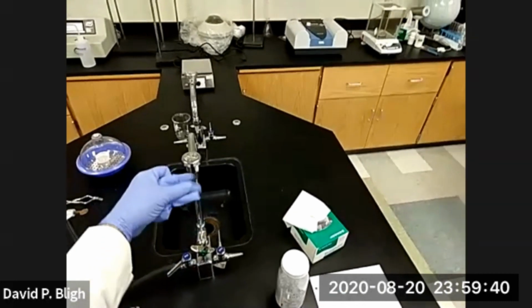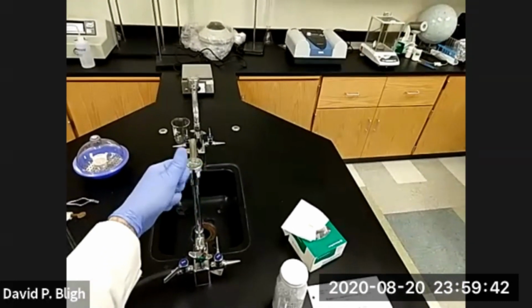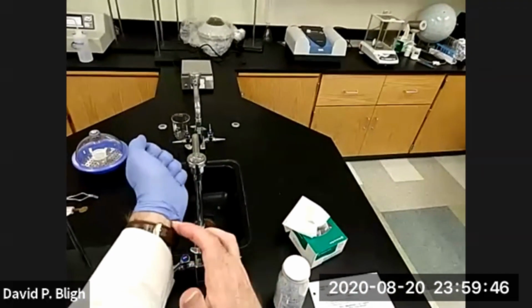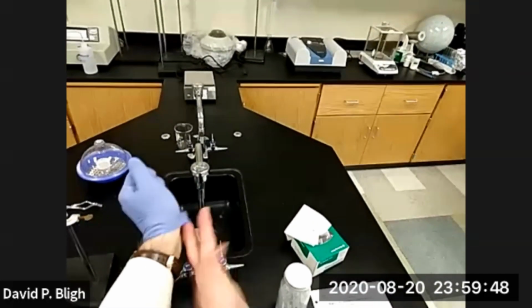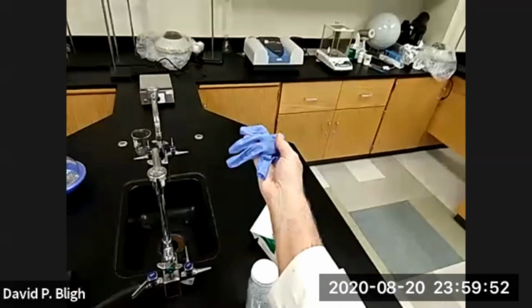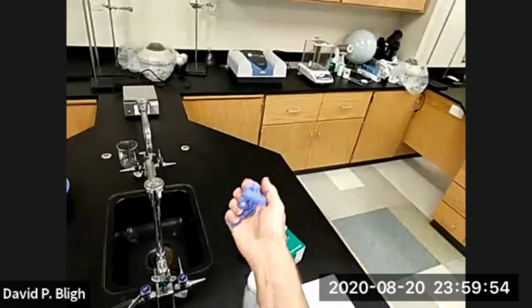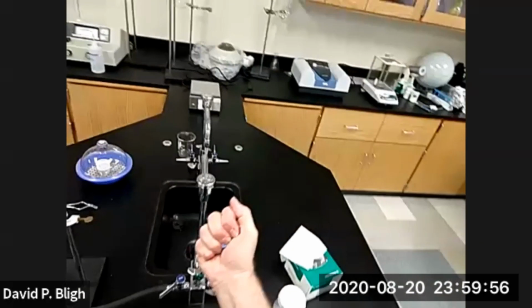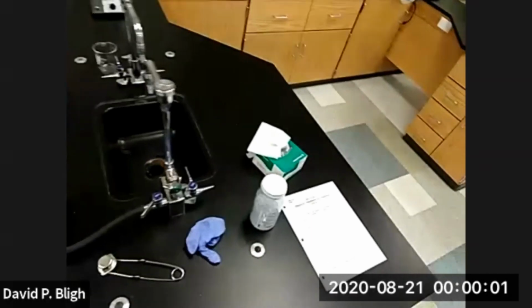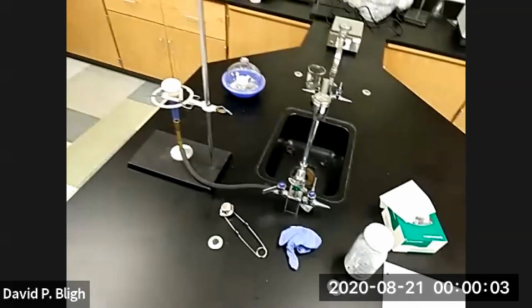Then you wad it up in the palm of the other glove. Now this is a clean hand on clean skin. You go underneath the second glove and invert it like that. And now you've got the contamination contained. Okay.